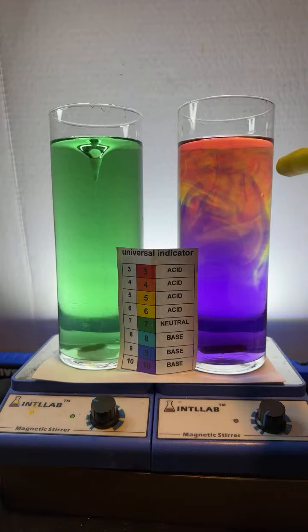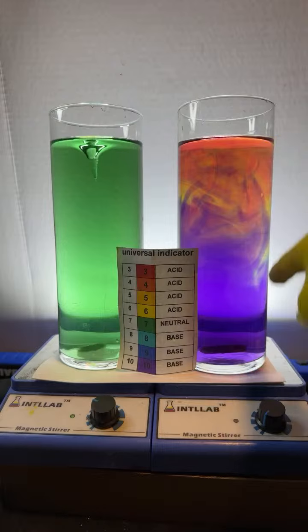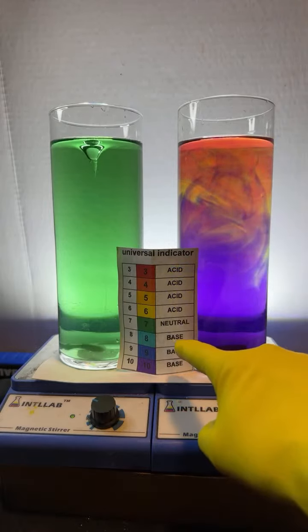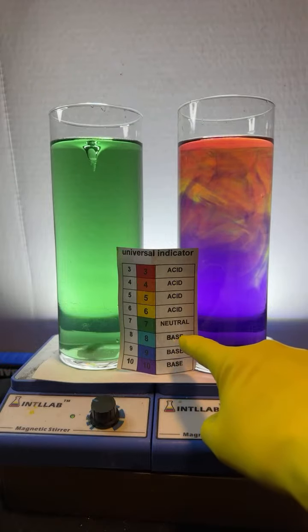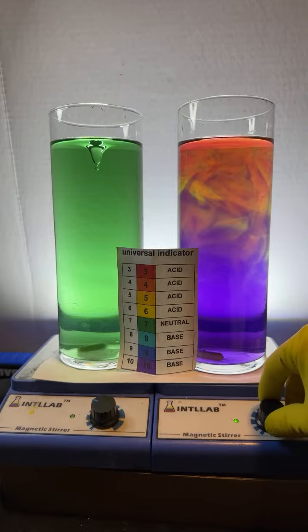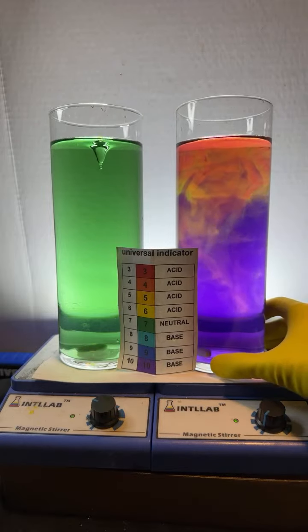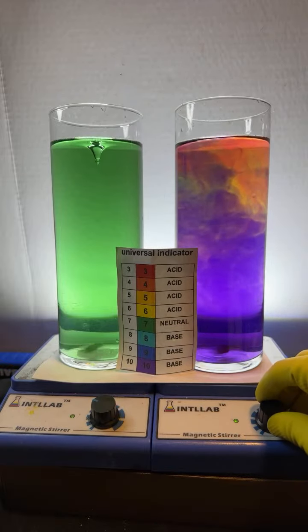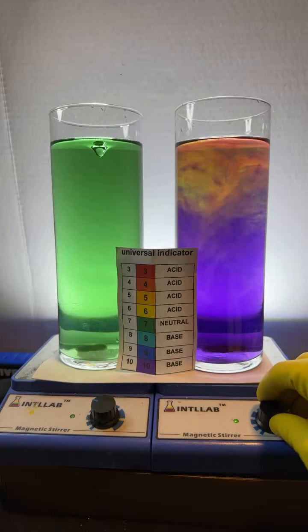Okay, let's try this over here. Once again, if there's more acid than base, it'll end up being red, orange, or yellow. If it's more base than acid, it'll be aqua, blue, or violet. And if they're perfectly balanced, it'll be green. And if the stir bar doesn't work, then we won't figure anything out. Here, let's try her again. That's correct. LSD is actually an acid.